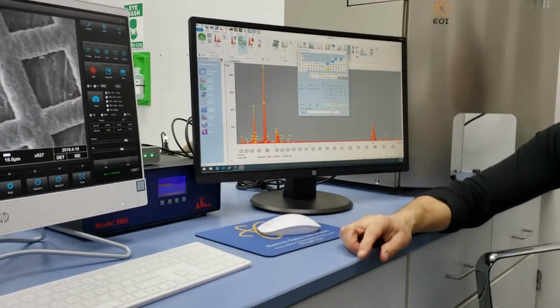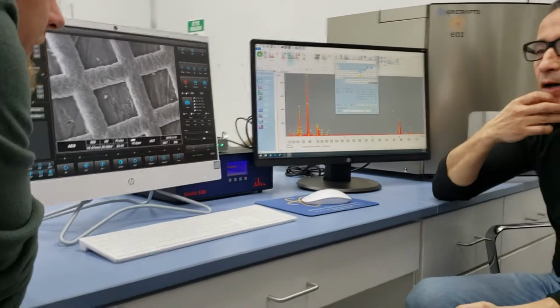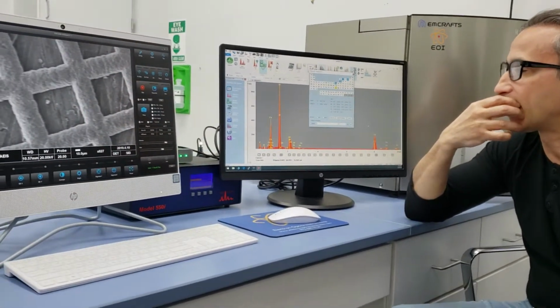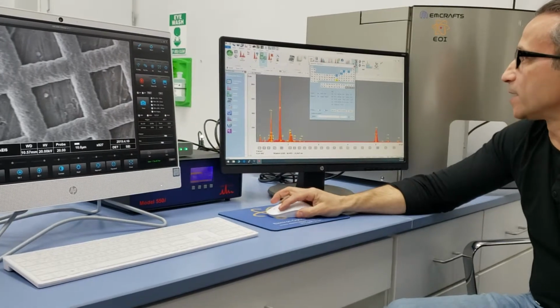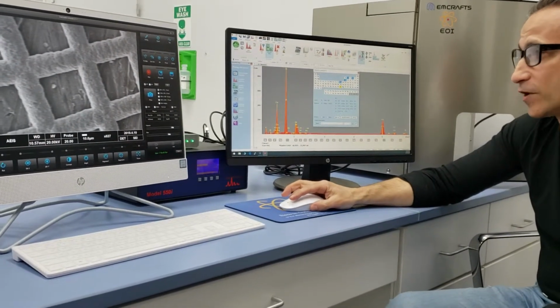How do those peaks correspond to the amount of, let's say, copper? Let's say copper is right here. How would you read that? How many percent? Well, if you want to get the numbers, or parts per billion or whatever, which we haven't gone over yet, that's our next step.